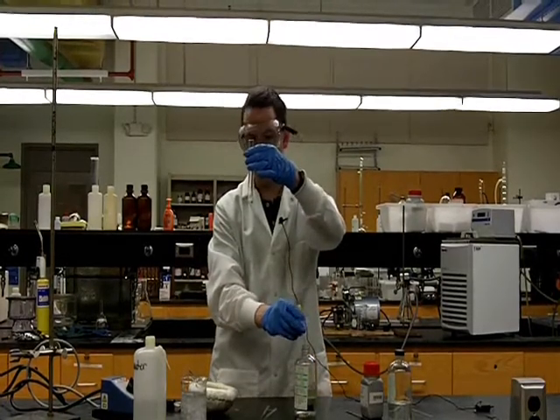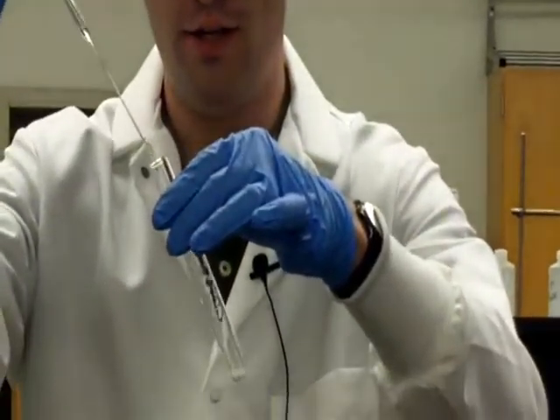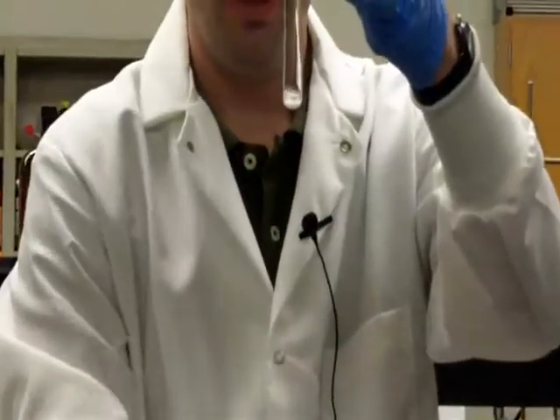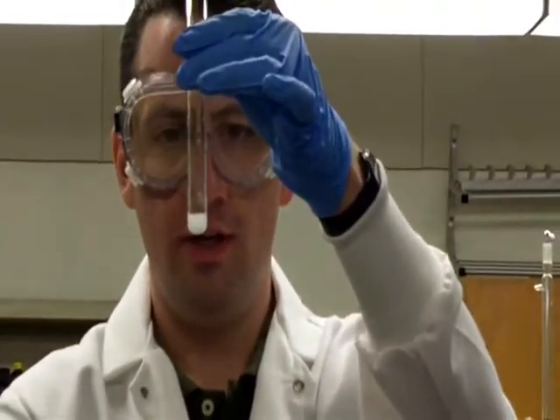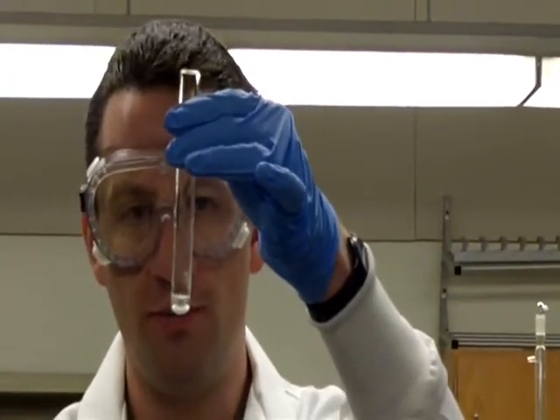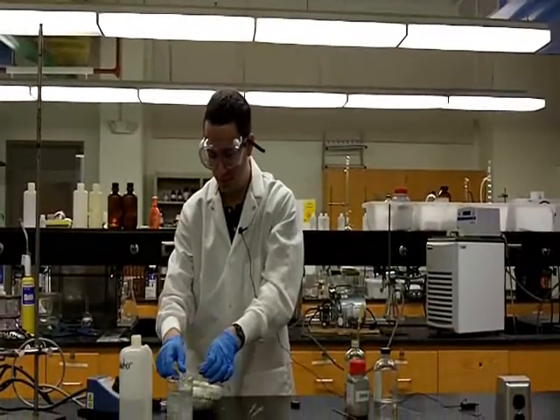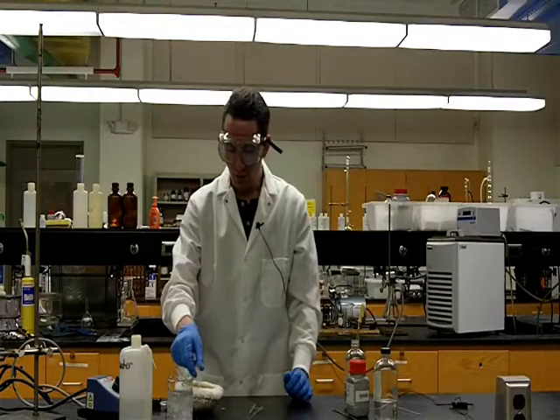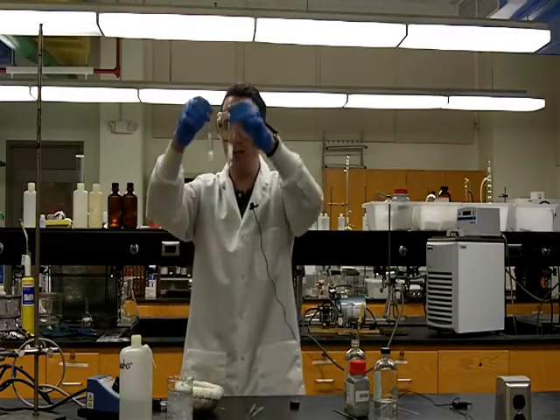While that's going on, I'm going to start my third trial, and this one will use methanol. So again, we'll add a small amount of methanol to this sample, and as in the case with water, we can see that the fluorene has not dissolved at room temperature. So I will also add the methanol sample to the sand bath and let that one come to a boil.